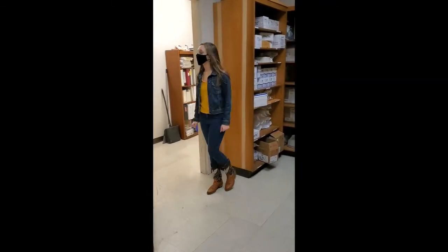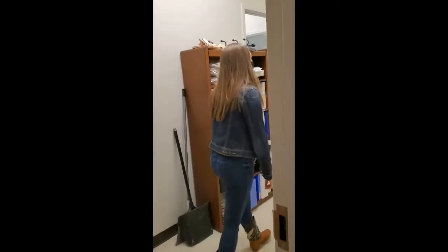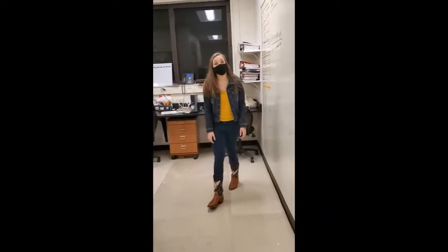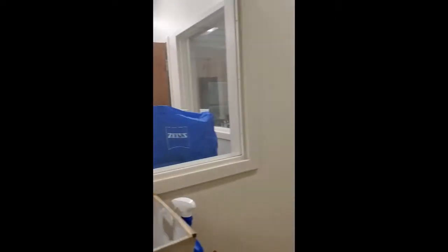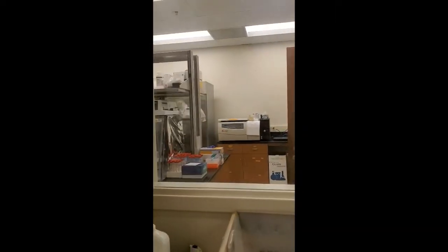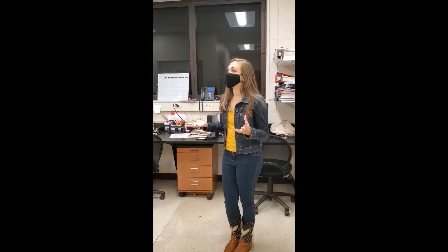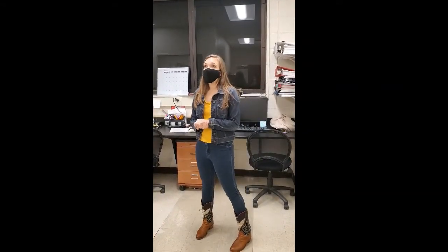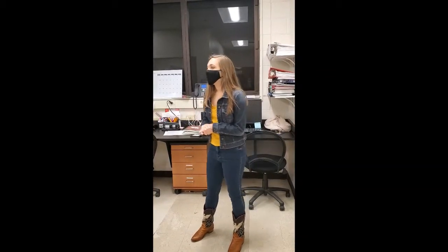All right, so now we're inside the lab of Dr. Earhart, where I do a lot of my research. We are fully equipped to work with BSL-2 microbes, and what he's got going on right now are avirulent, so non-pathogenic, non-harmful strains of anthrax, as well as Yersinia pestis. So we are equipped to handle those kinds of microbes. He does a lot of microbial forensic lab work as well, not casework.